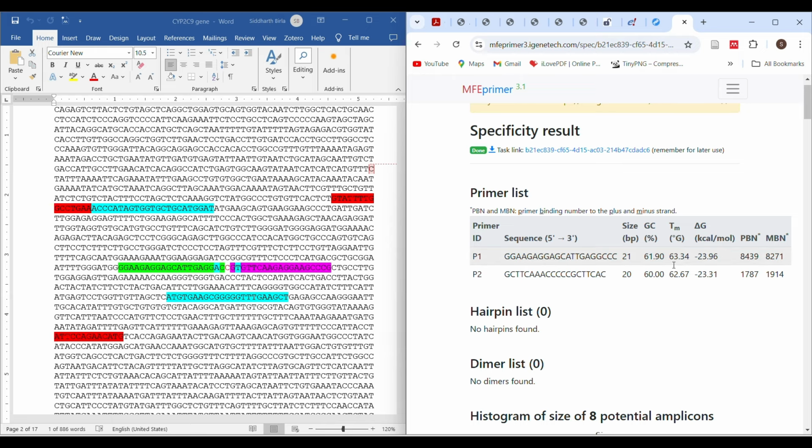So when I give this particular specific temperature, this bond will be formed between these two. Of course not here because a mismatch is there, right? So when the mismatch is removed, then only it will be making the primer, right?